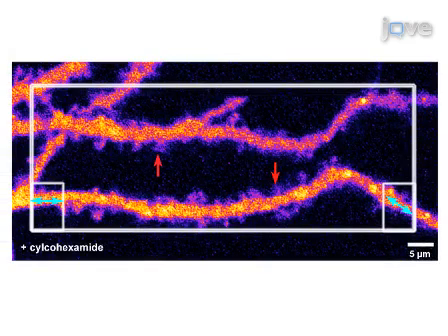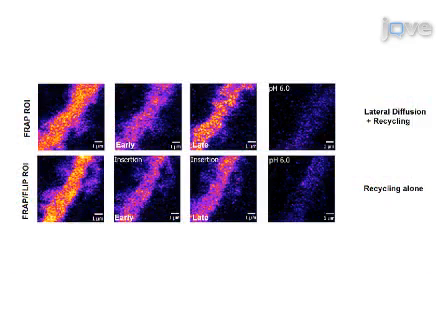Ultimately, this adaptation to conventional FRAP experiments is used to show the pattern of exocytosis events of the target protein in the plasma membrane. The main advantage of this technique over existing methods like surface biotinylation or antibody feeding is that it enables the dynamics of membrane insertion events to be visualized. These methods can help address key questions in protein trafficking, such as where and how exocytosis events occur.